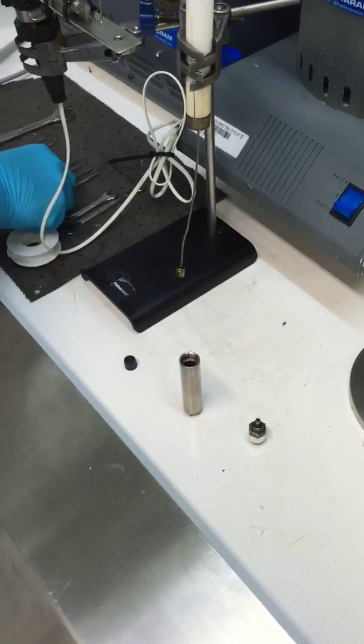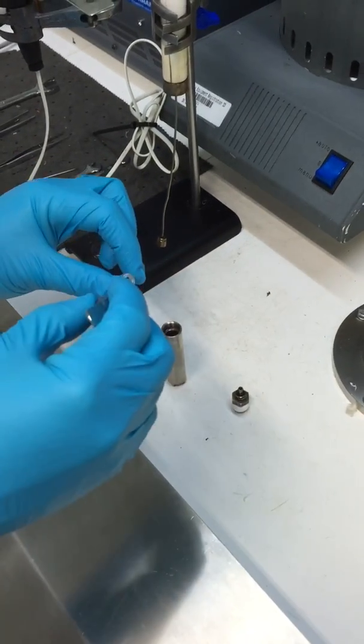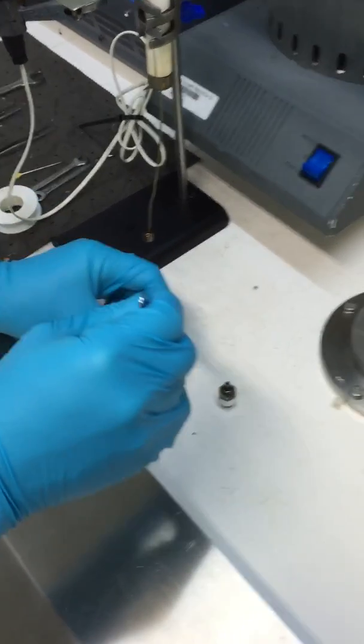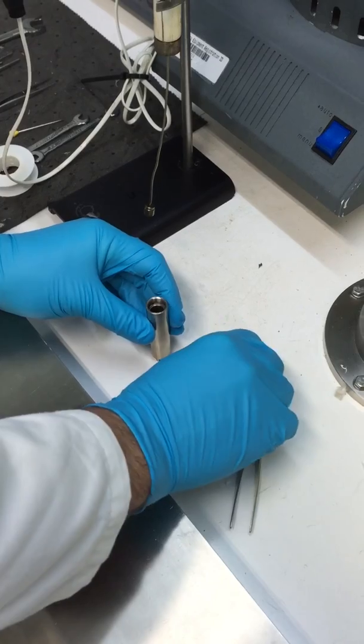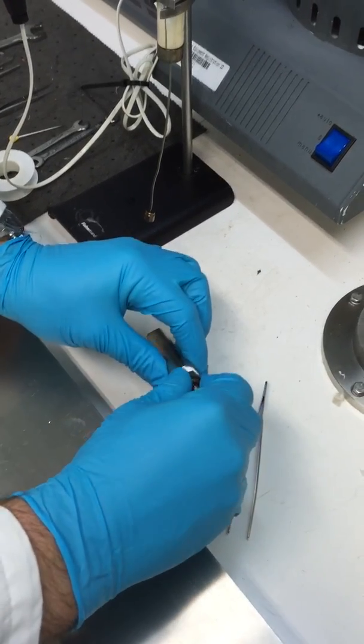We place our sample into the cell. Generally we use tweezers to drop it in so we don't spill any sample. We then connect the nut to the top with finger tightness to start with.